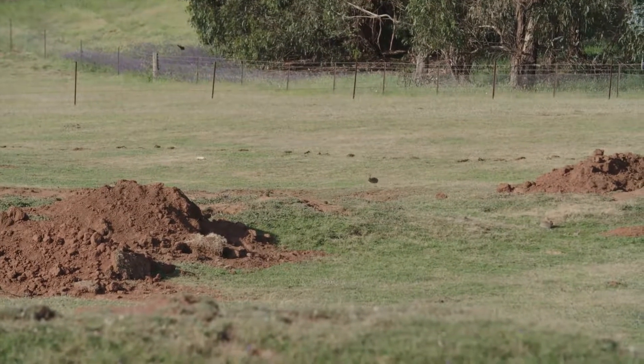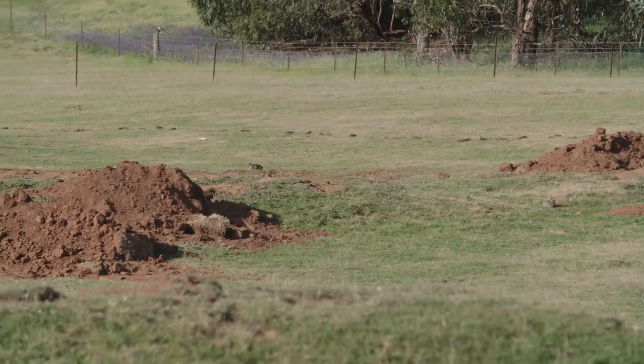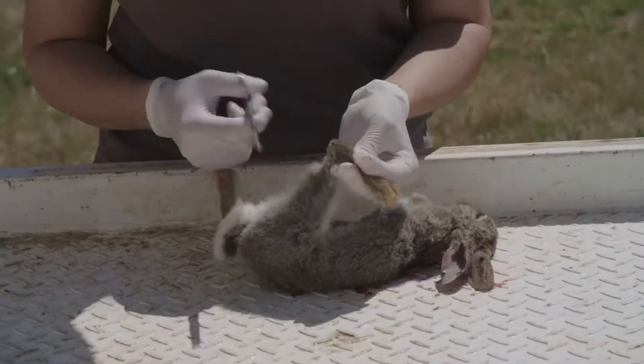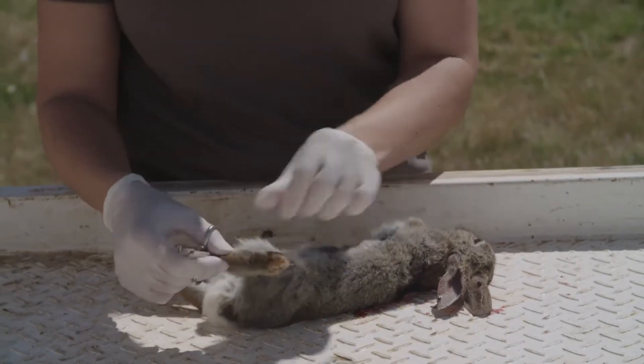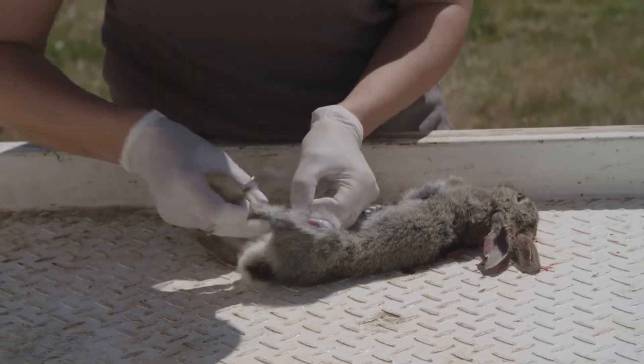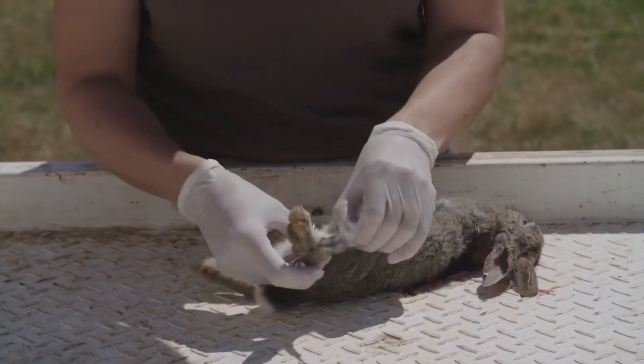If you get to the rabbit and there's no liver because crows or foxes have already come and eaten it, then you can use a bit of hind leg bone. It's a little bit harder to get, but there's enough virus in the leg bone for us to identify what the rabbit has died from.